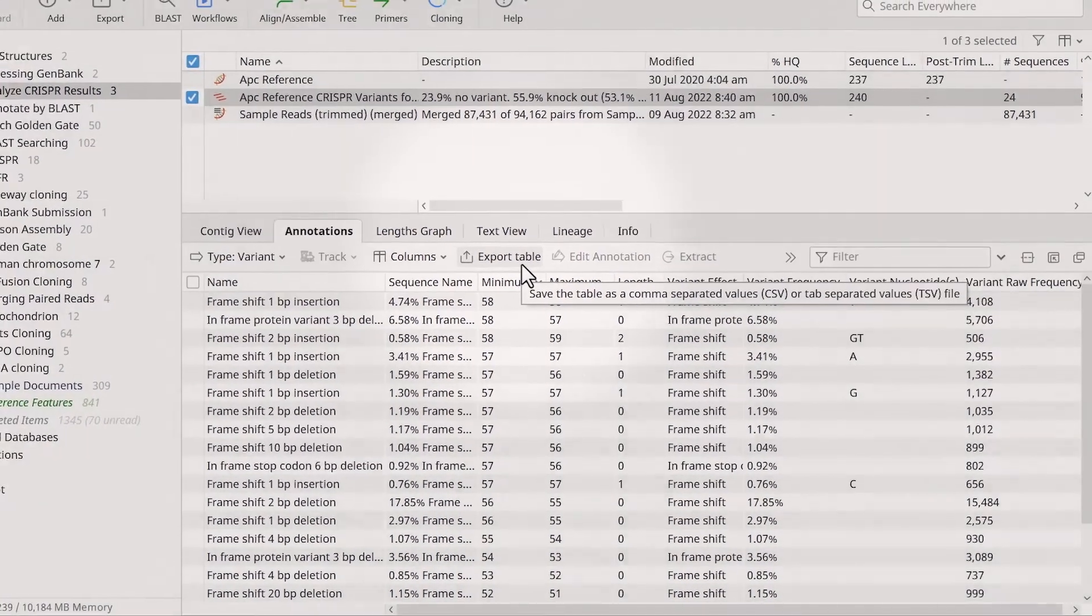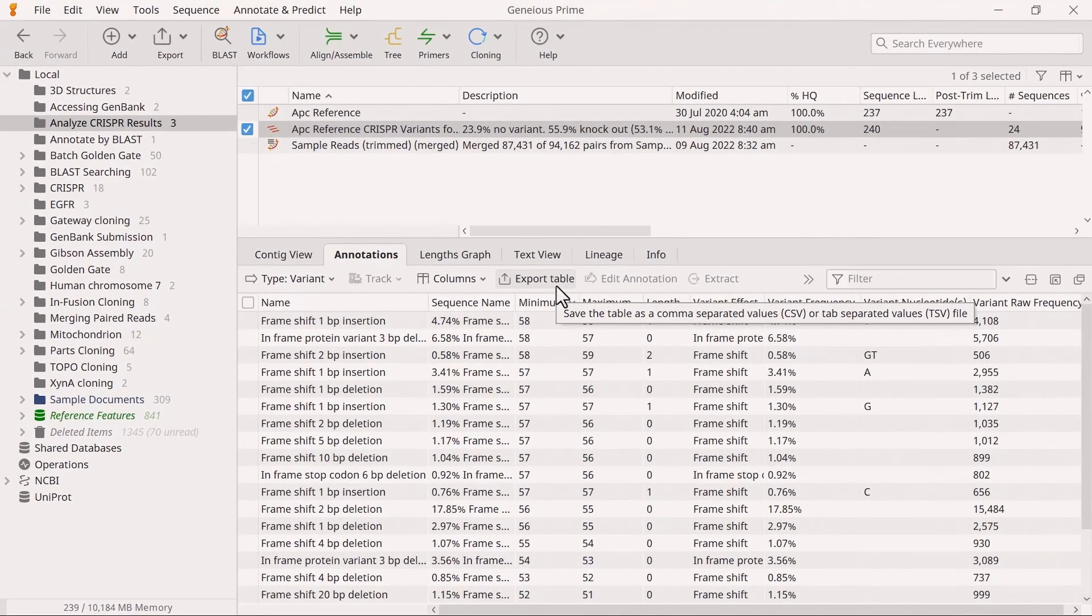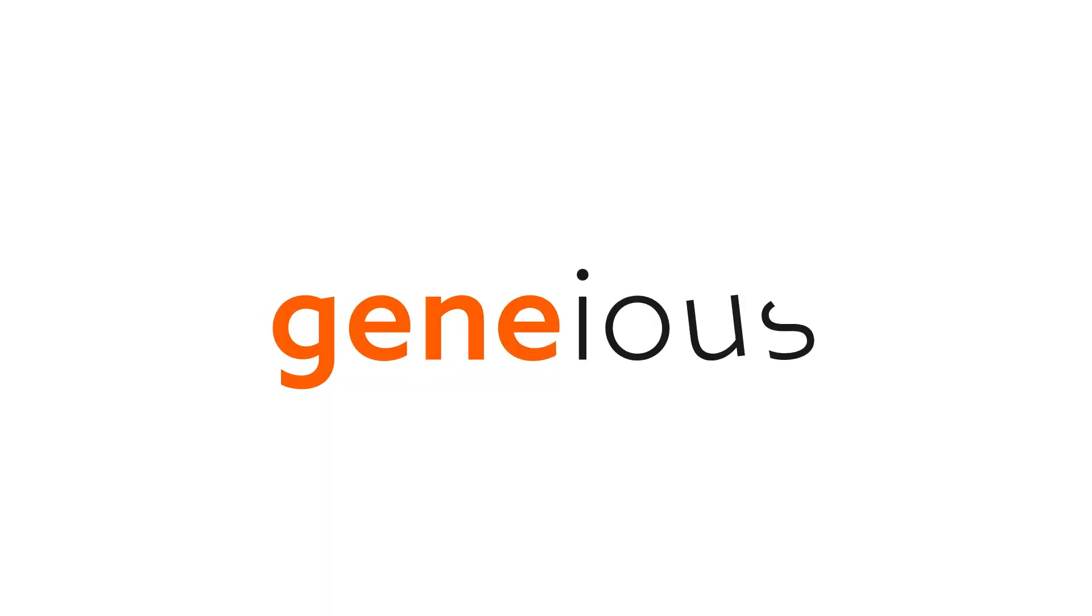And that's how you can analyze CRISPR editing results in Geneious Prime. To learn more, visit Geneious.com.